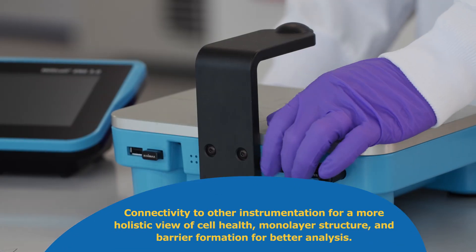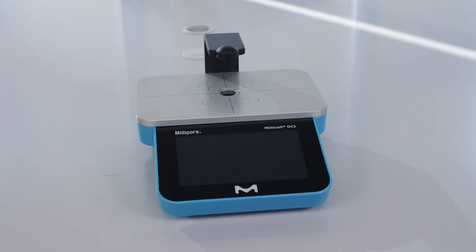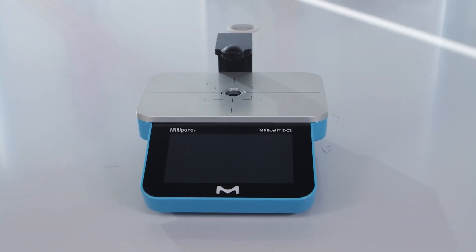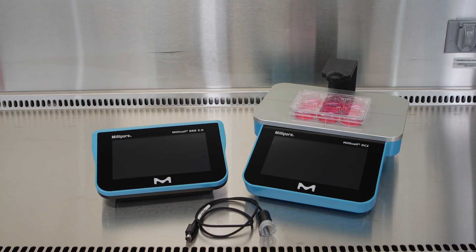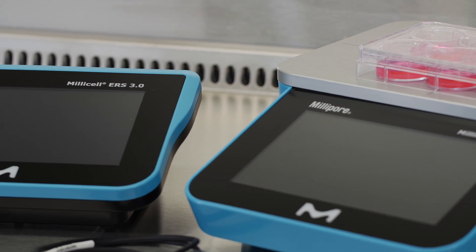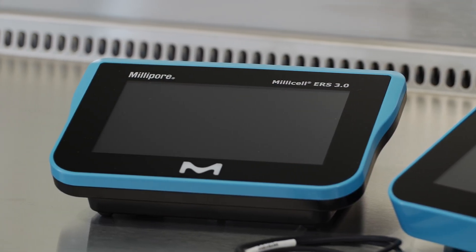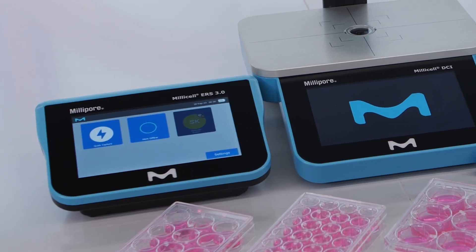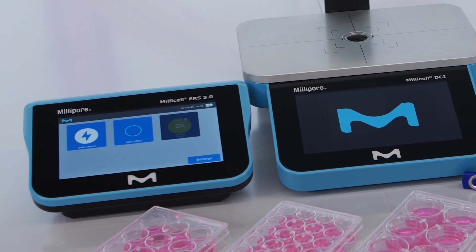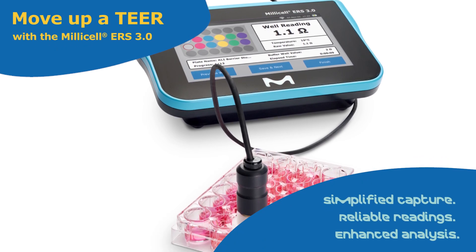The Millicell DCI digital cell imager enables quick, objective, in-vessel determination of common cell culture parameters, including confluency and cell count. Then move to the Millicell ERS 3.0 for rapid, reliable TEER data. Our connected lab instruments support connectivity for a more holistic view of cell culture status. Move up a tier with the Millicell ERS 3.0.